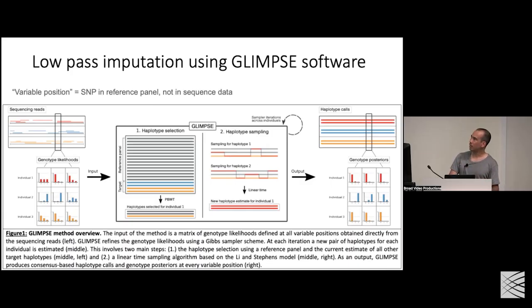And then once you get these, you get your posteriors that are informed both by the phasing and imputation portion of things, of what reference panel haplotypes you think you most closely match, but also informed by those priors based on that low pass. There's a lot more to this than just this, but hopefully that gives you a schematic of taking low pass and doing that same haplotype selection with this and then running imputation.